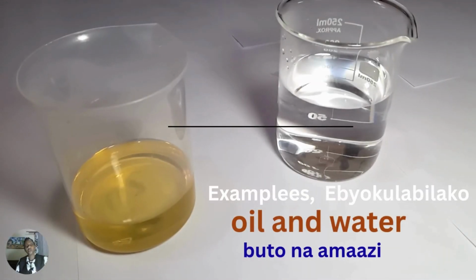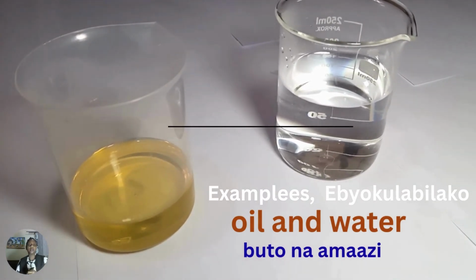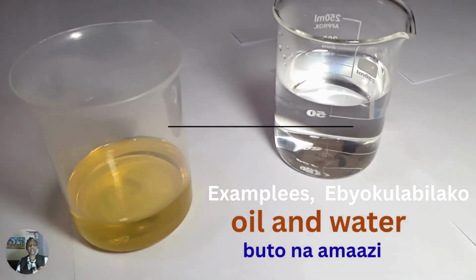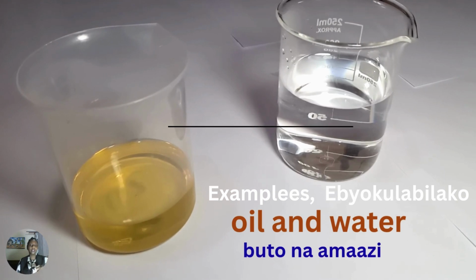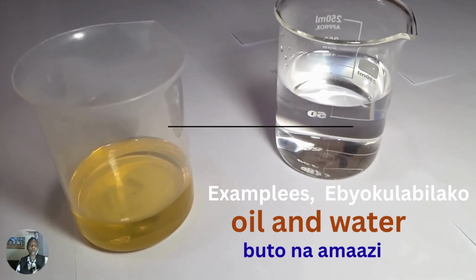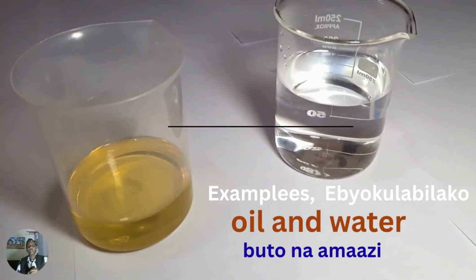So right now, these are the two examples of liquids that you can mix and you get an immiscible liquid mixture. Right here, this is water and this is cooking oil. The one which is colorless is water and the one which is yellow is cooking oil. So when we mix them, we are going to make two layers.